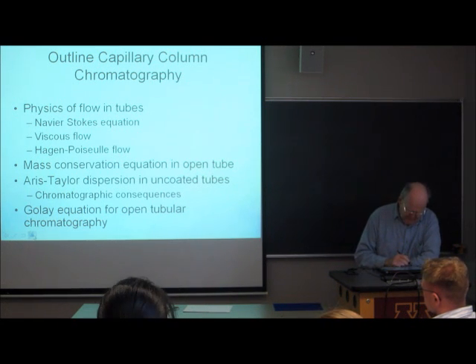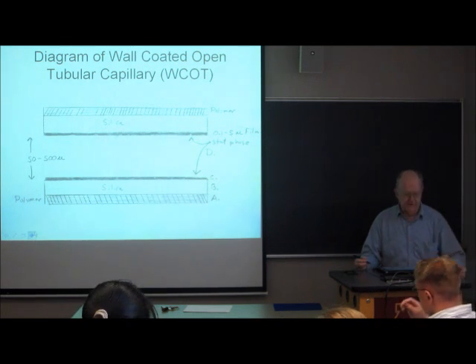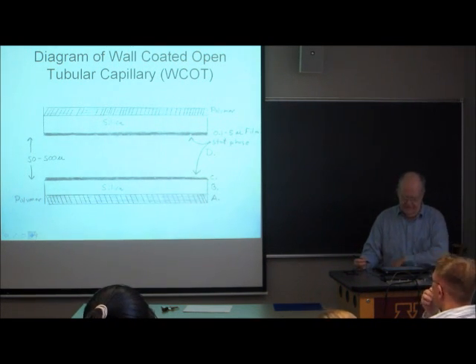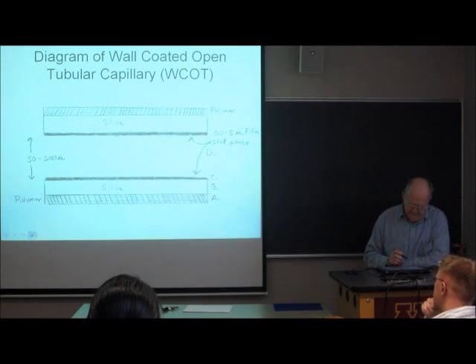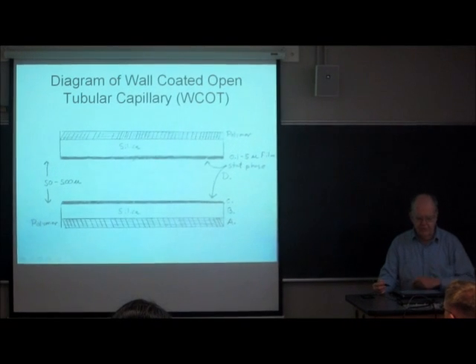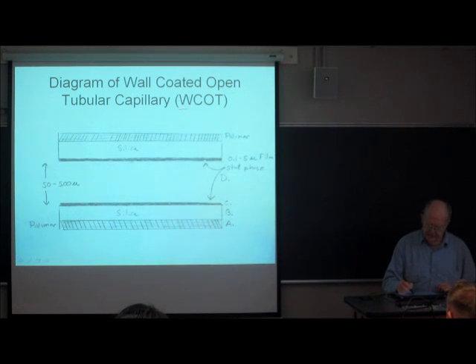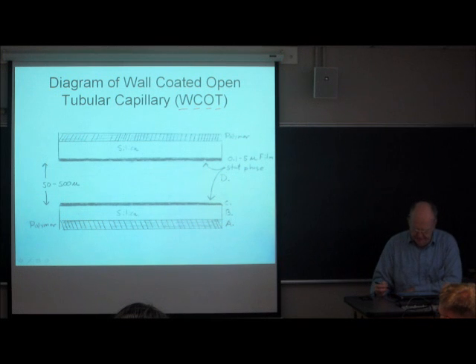Okay, let me go there now. Here's my rendition of what that looks like. This is what we call wall-coated open tubular chromatography in a capillary. And you'll see people use that acronym WCOT.